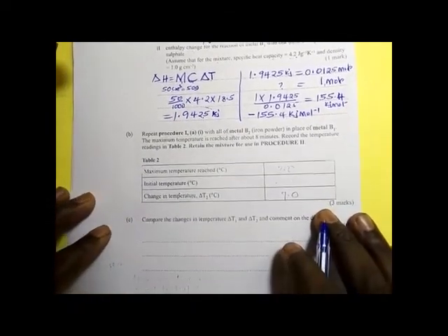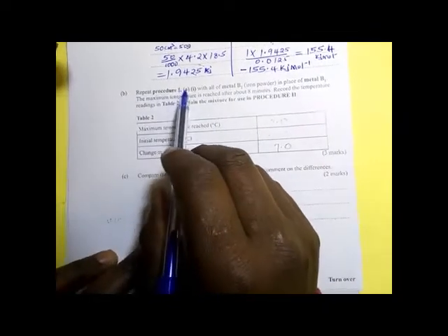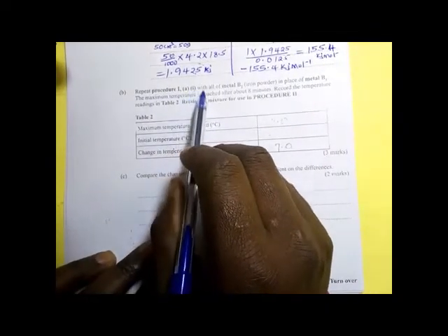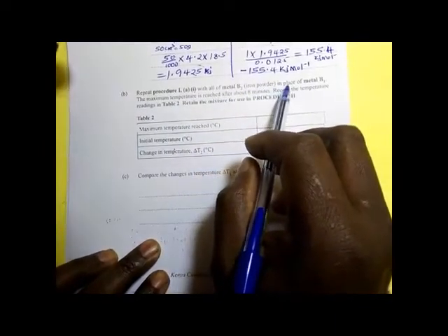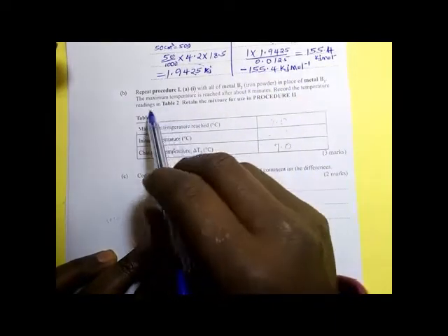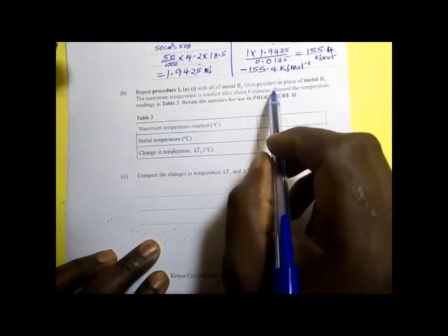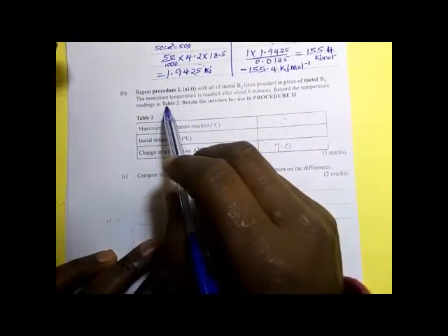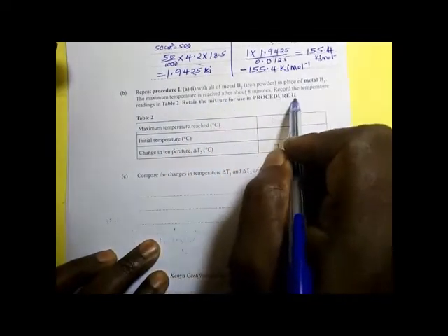Let us go to procedure 2. Repeat procedure 1A, Roman 1, with the metal B2, iron powder, in place of metal B1. The maximum temperature is reached after about 8 minutes. Record the temperature readings in table 2. Retain the mixture for use in procedure 2.